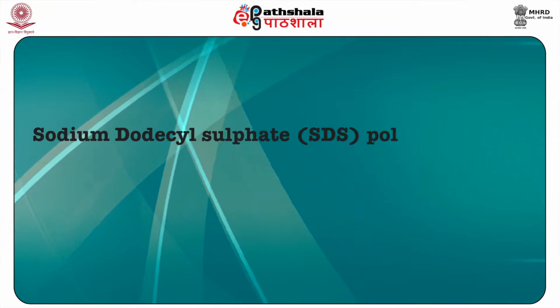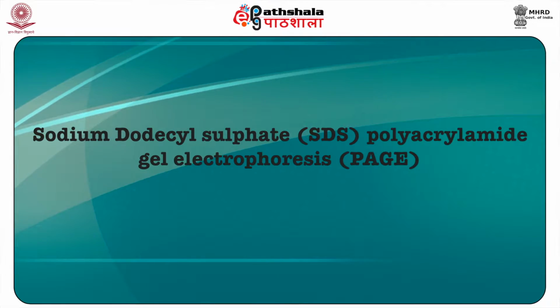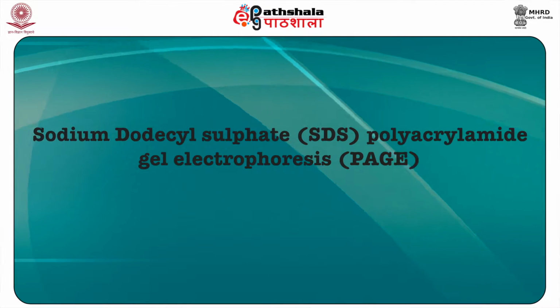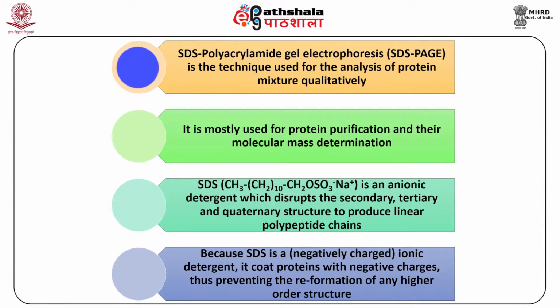Let us now discuss SDS PAGE, or sodium dodecyl sulphate polyacrylamide gel electrophoresis. SDS PAGE is a technique used for the qualitative analysis of protein mixtures. It is mostly used for protein purification and their molecular mass determination.